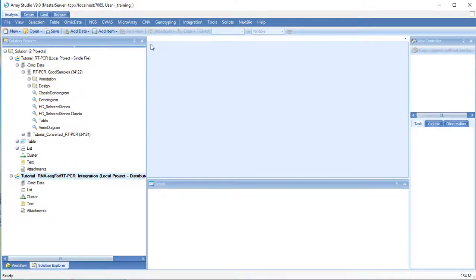If you have RNA-seq data for the same samples as your RT-PCR data, you can easily compare them, for example, to confirm that the RNA-seq data looks similar to earlier RT-PCR validation. You can add your data directly to your RT-PCR project or import them to a new project. In this tutorial, we will be using FPKM data already in a tab-delimited file.